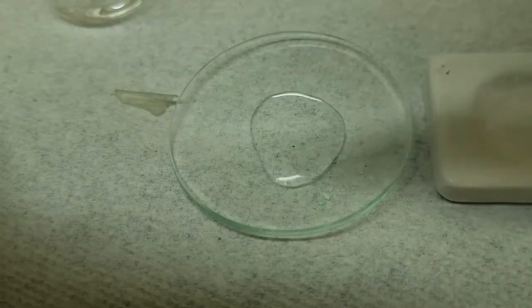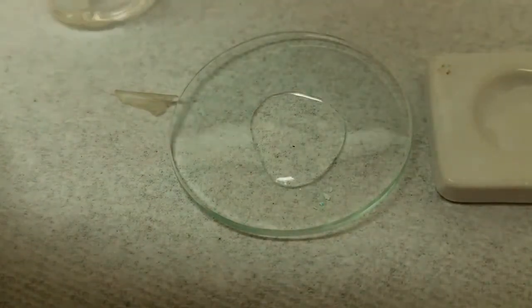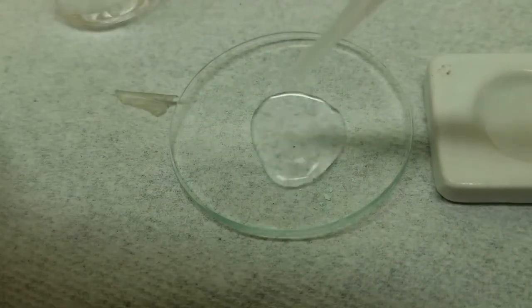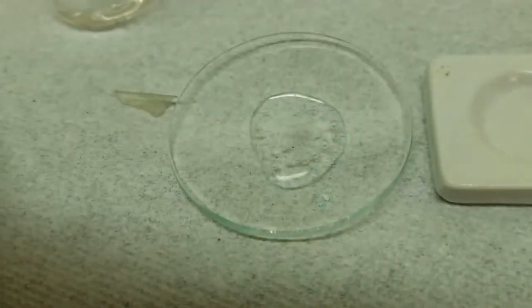All right, so now we're going to do some chemical tests. In here, I have some bicarbonate, and then to this, I'm going to add various acids. So first off, we're going to start off with 6 molar acetic acid. See what happens when we add a drop. Think about what that means.